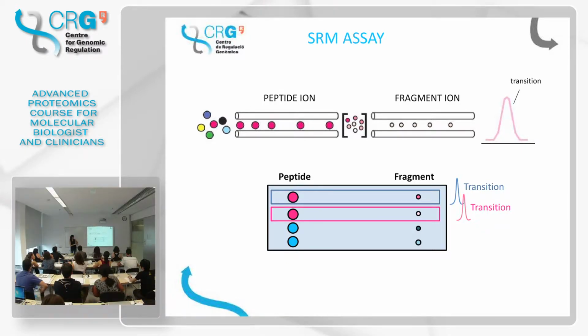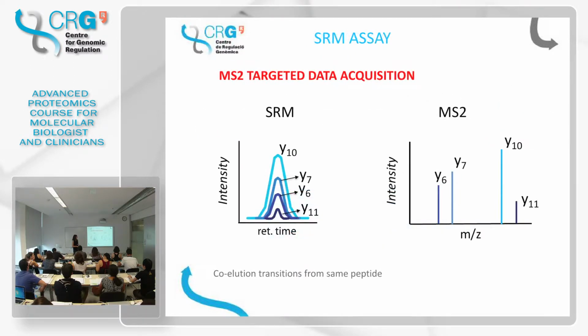This peptide will be at a different retention time than this one. But the fragments are the same. But all the fragments from one same peptide coelute. In the same retention time? Yes. This is the most important concept. Okay?